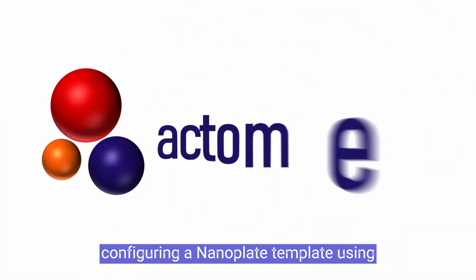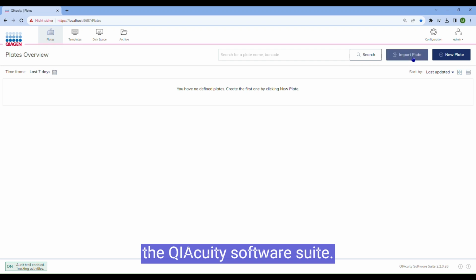Welcome to this step-by-step tutorial on configuring a nanoplate template using the QIAcuity Software Suite.